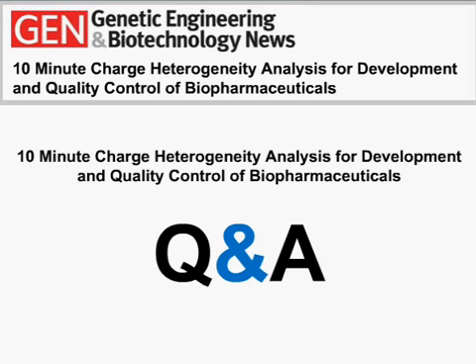So with the Beckman method, you actually have a 2-step separation: isoelectric focusing on the bottom end, and then on the top end a chemical mobilization, which is actually more of a free zone. So you can get effects based upon differences in the mobility of the compounds. And that's why we see the expansion of that 8 to 9 range, which causes pI shift effects when we see the chemically mobilized gradient as opposed to the static imaged ICE. With that said, the big advantages with the ICE method are the speed and the fact that you're not affecting the gradient during the detection step.